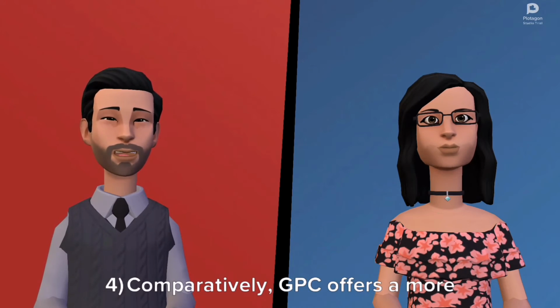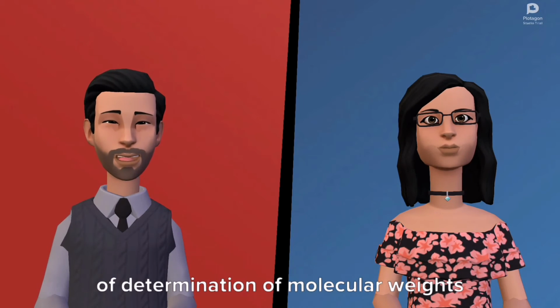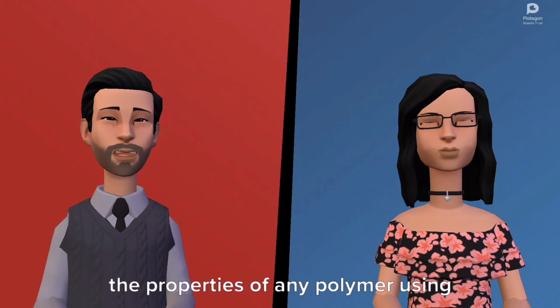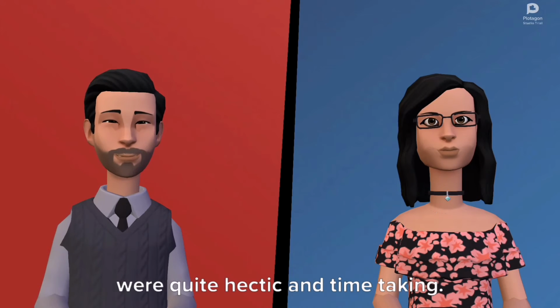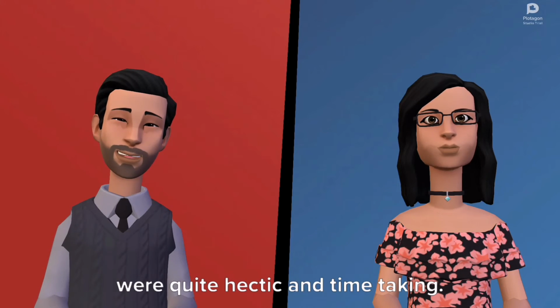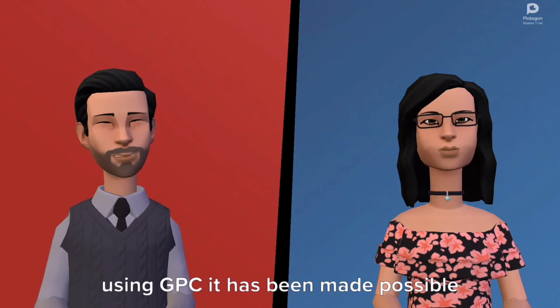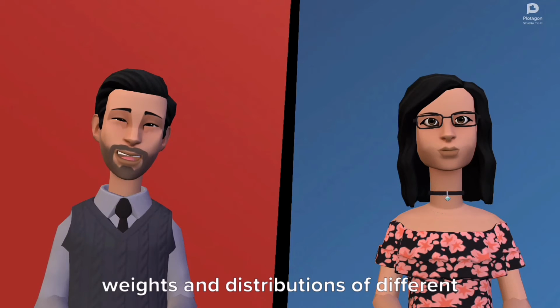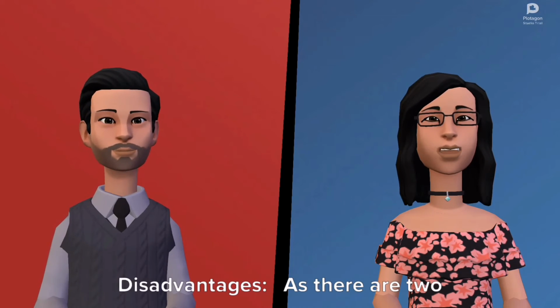4. Comparatively, GPC offers a more convenient and less hectic method of determination of molecular weights of polymers. 5. It is very easy to investigate the properties of any polymer using GPC. 6. The processes used in the past were quite hectic and time-taking. The procedures were laborious, but using GPC it has been made possible to quickly determine the molecular weights and distributions of different polymer samples.